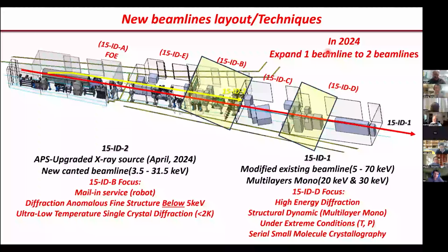A lot of people want to do something along a certain axis and get some feature or correlation out, like a 5-axis scan to see the profile of the diffraction.